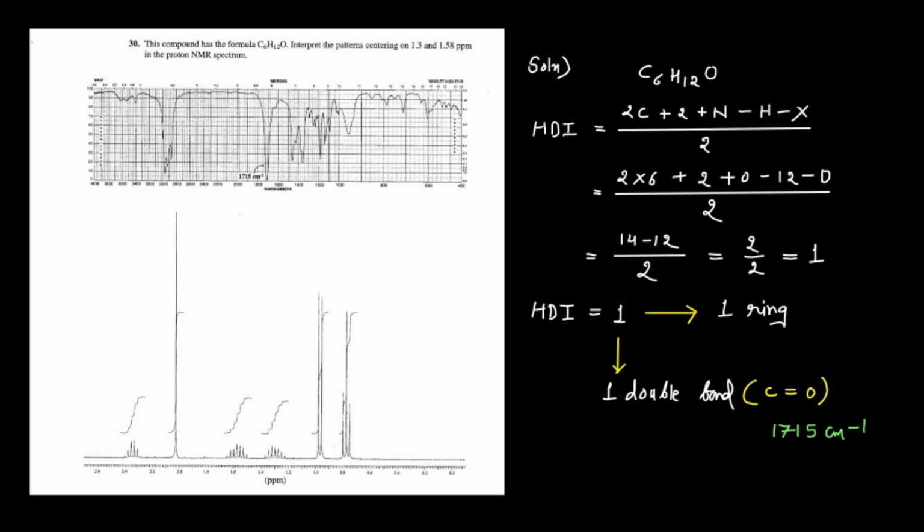Because in this particular problem, we will use the DEPT NMR spectrum as well, along with the proton NMR spectrum and the carbon spectrum. Okay, the carbon spectrum is not there, but certain values are there. So this problem is going to be very, very important.